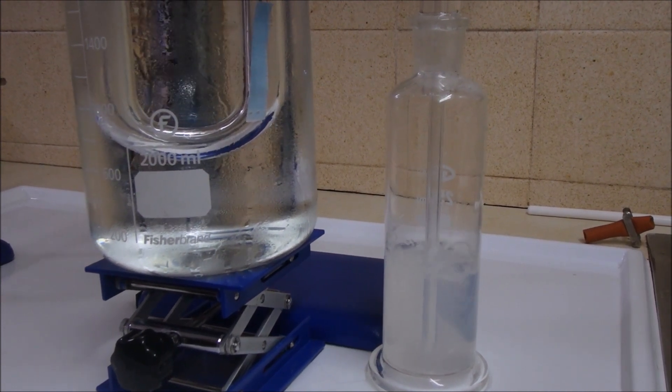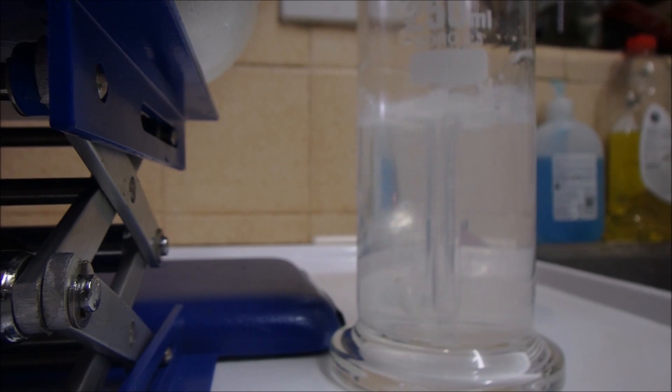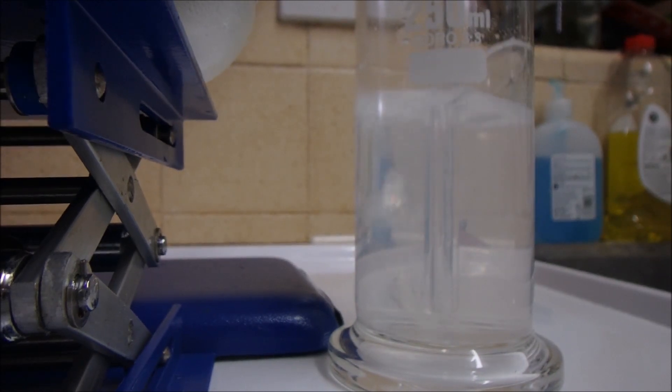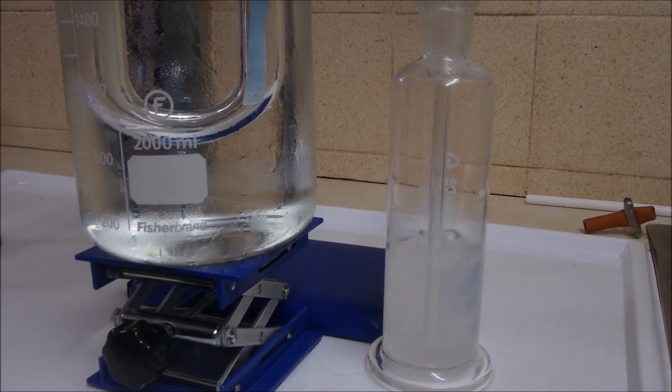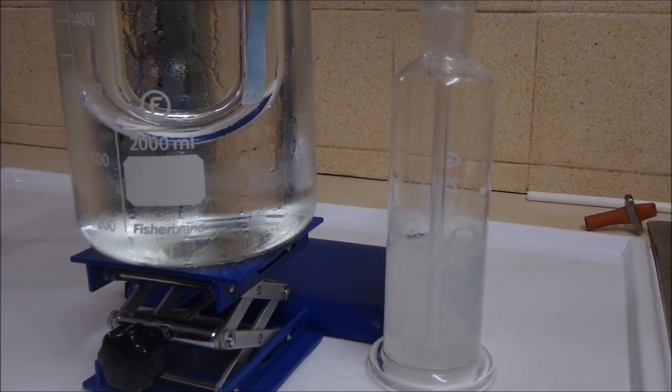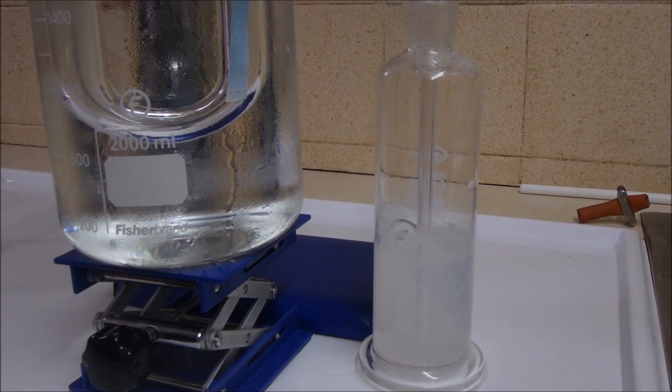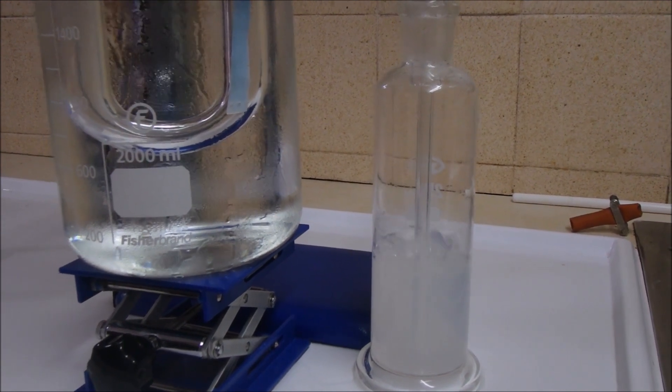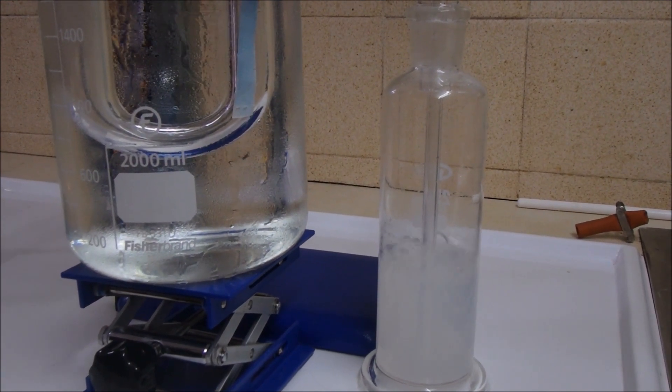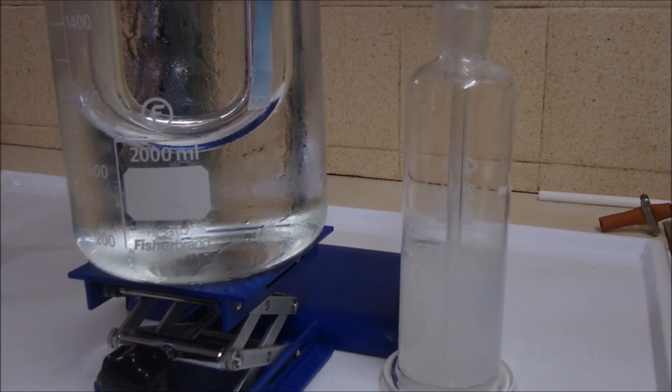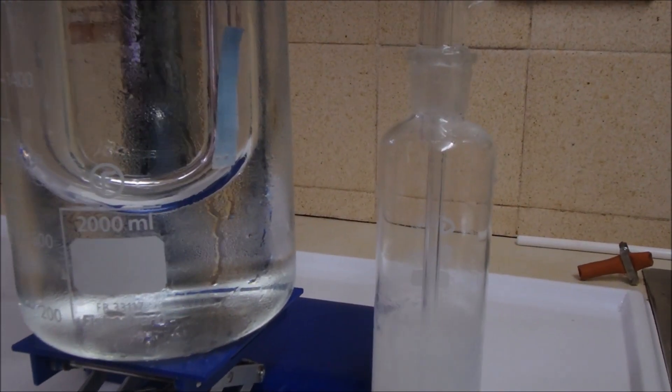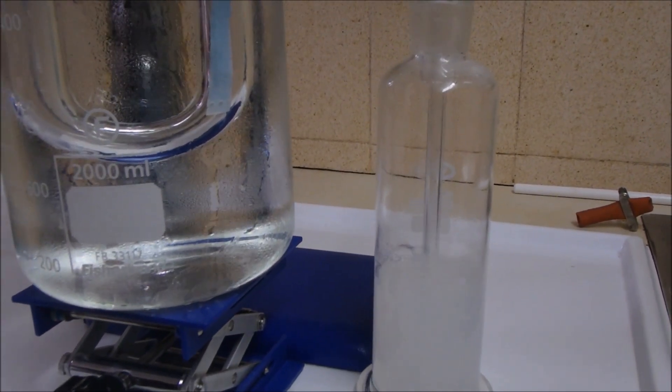So I can see the lime water starting to turn cloudy. And see if we're getting the water detected by the blue cobalt chloride paper. It's not doing as well as before, simply because I've managed to get the last one a little bit lower. But the carbon dioxide definitely we've got.